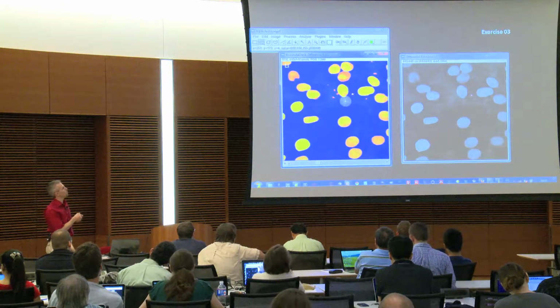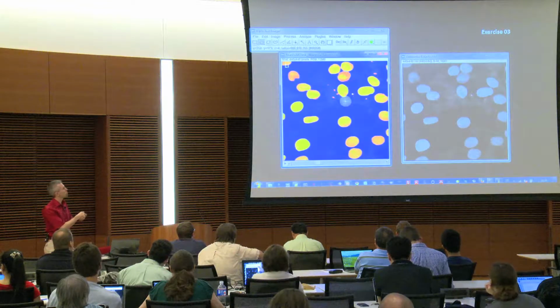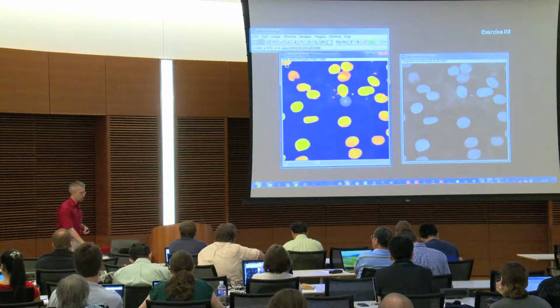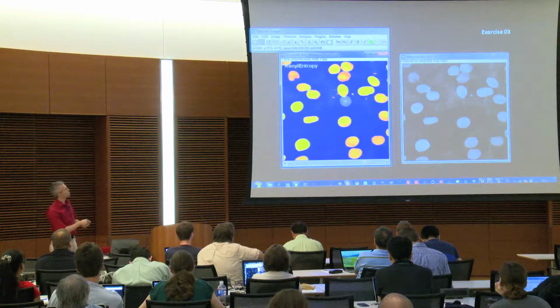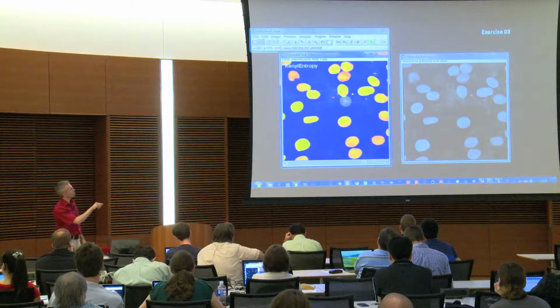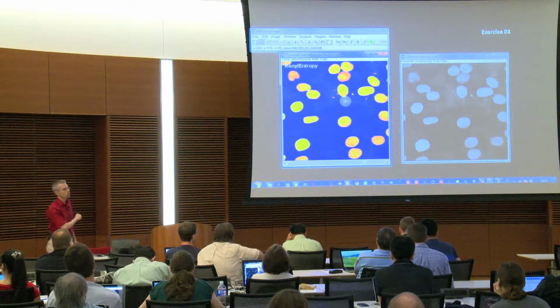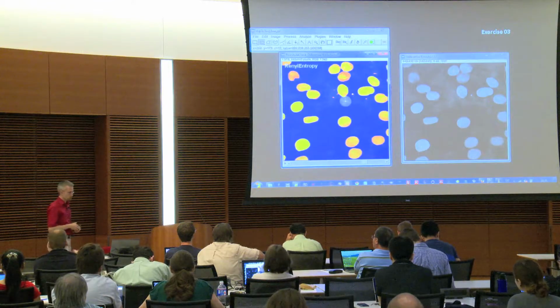So this tells you, okay, if I use the threshold later on, then I can still separate the particles exactly where I want to separate them. And since I decided beforehand Renyi entropy looks actually best, we can have a look at that. And then we see, okay, these ones were connected, are separated, these ones as well, and even the small piece I can cut off still. So actually Renyi entropy would be finally a good choice.